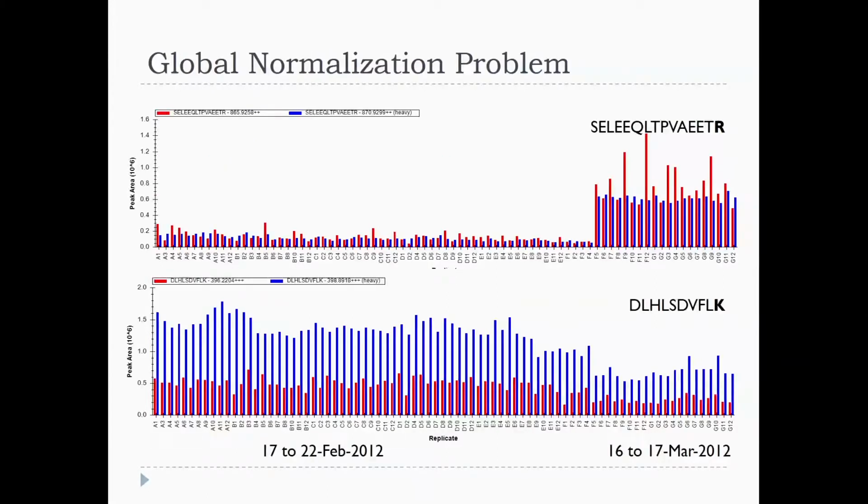Okay, well, we still have the dates here, but tell me what you see here and what's unusual. What's going on in these two plots? We got 2 peptides collected in the same experiment. This is an SRM experiment. We got light and heavy, and what's happening in the first one? Who can tell me what's happening in the first one? This is an easy question, so answer quickly.